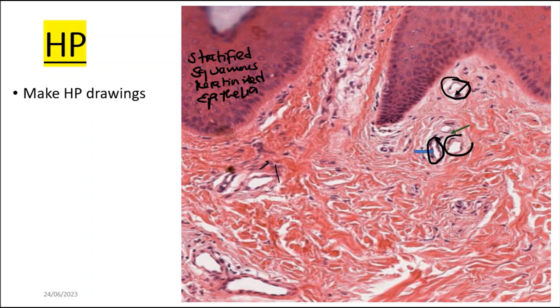How do I tell that this is a blood vessel? Look at this. This is the nucleus, and this is the nucleus. The nuclei are forming a circular shape here, like this. Okay. So now I understand that there is a lumen between the nuclei. So this is the blood vessel, meaning these are nuclei of the endothelium, which is the epithelium in blood vessels.